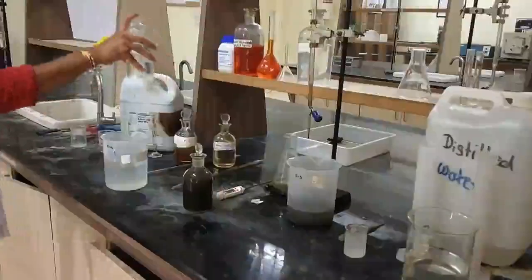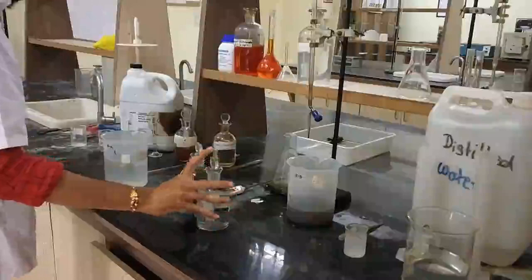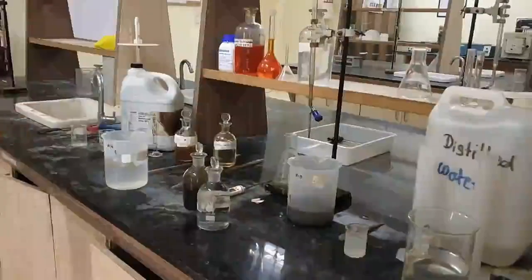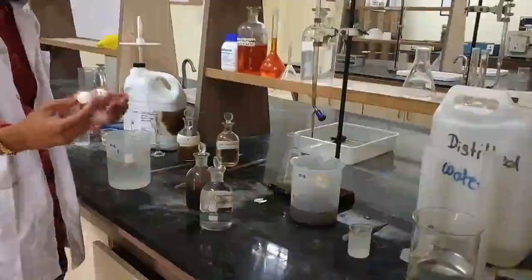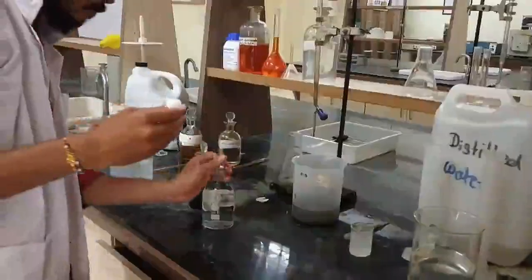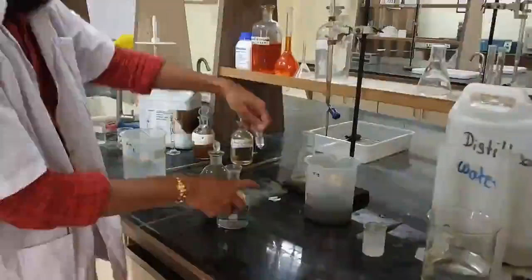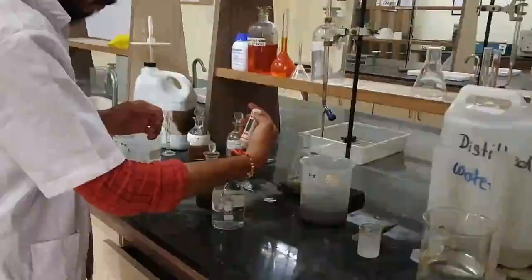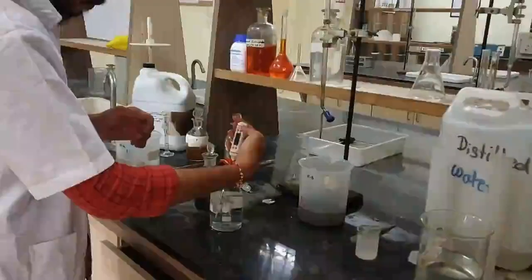Now we are going to measure the temperature with the help of the thermometer of both the samples. So we'll be removing the stopper and measure the temperature. The ambient temperature of a lab is 22.6.